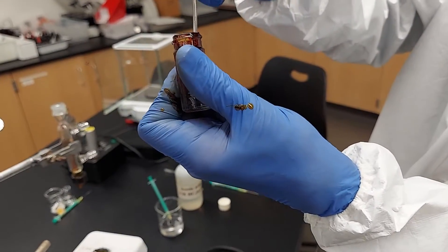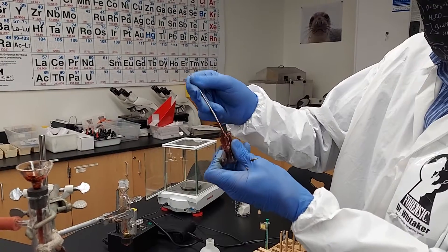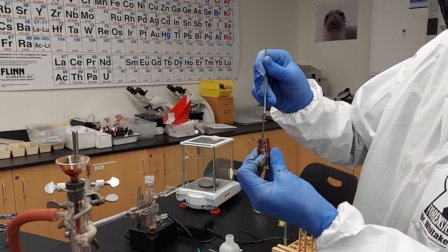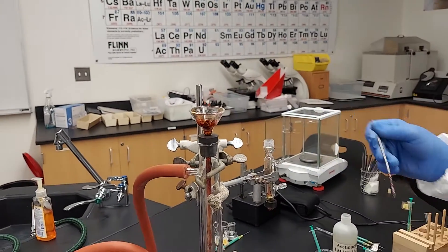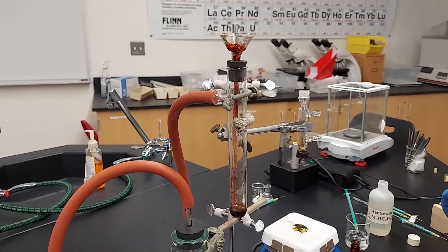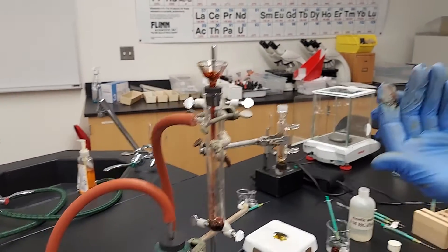A little methyl red right on the old glove there. We'll let that suck for a little bit. Put this somewhere where we don't get red. Nice red there.